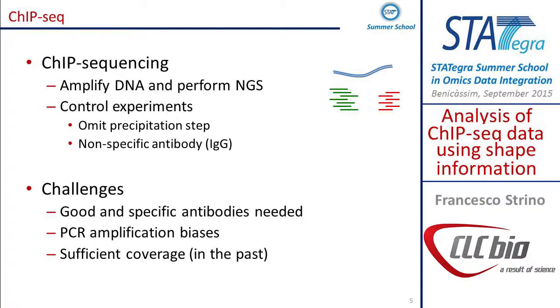And so from, for example, this initial sequence, you will have a lot of amplification, and you will have a lot of reads that go either in this direction from here or this direction from here. So I will use green for things mapping to the forward strand, and red for things mapping to the reverse strand. And that's about it. So now we get a lot of reads, and they should come, theoretically, from places where the protein was attached in the beginning. And so we do that.